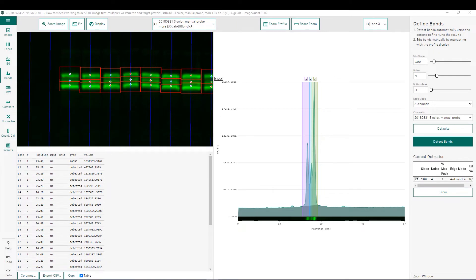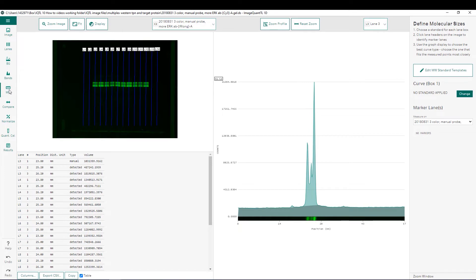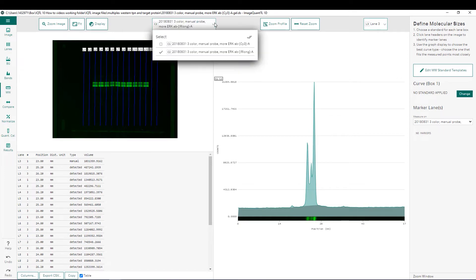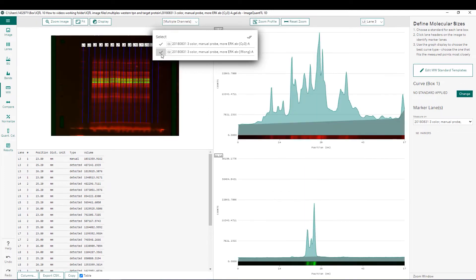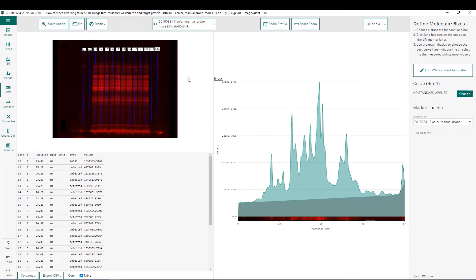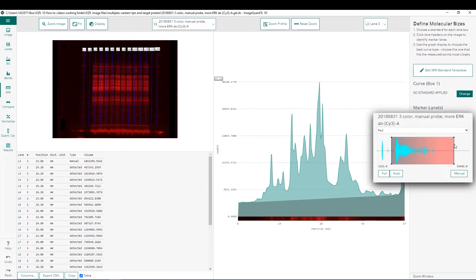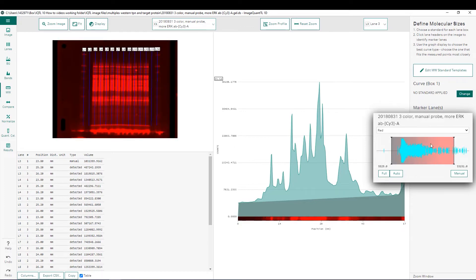Now that we've detected our bands, we can move on to the molecular weight determination step. Here, you want to choose which channel has your molecular weight markers from the pull-down menu — in our case, it's the channel with the total protein normalization. Make sure that same channel is also selected in the pull-down on the far right. Next, I like to adjust the display contrast settings to make sure I can clearly see the molecular weight bands in lane one and lane 14.